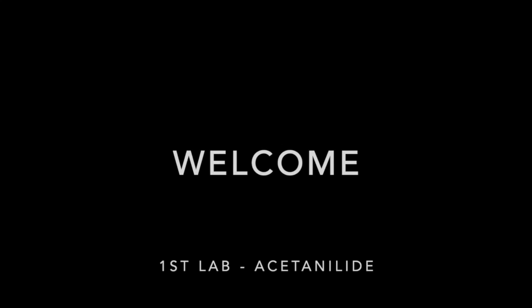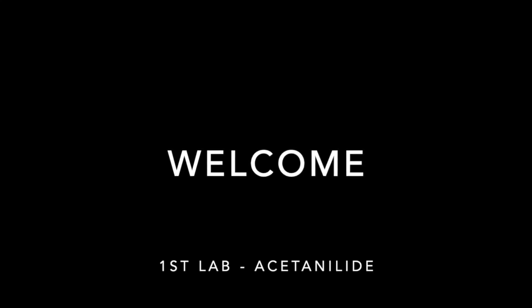Welcome to your nitration lab. In this lab, we will perform nitration on 2 compounds, so we'll have 2 separate labs. The first lab with acetanilide and the second lab with methylbenzoate. So let's get started on the acetanilide lab.